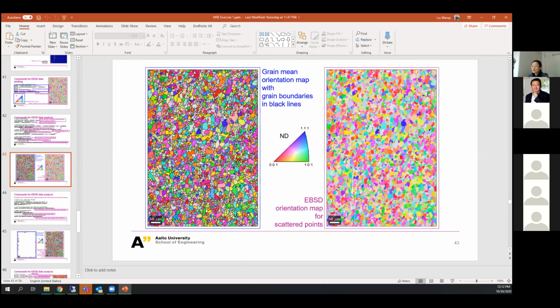But before that, we need to notice that for grain size and shape analysis, if you focus on some boundary grains here, they are not the whole grain actually. It's just because your measured area stops here along these lines. It does not mean this is a whole grain. So we need to delete all the boundary grains for the grain size and shape analysis.